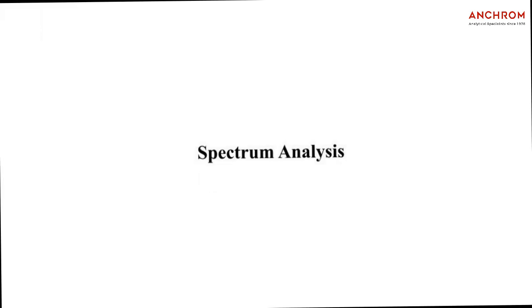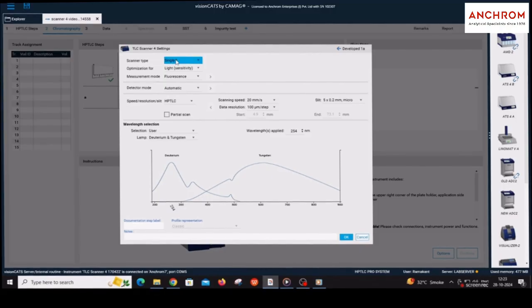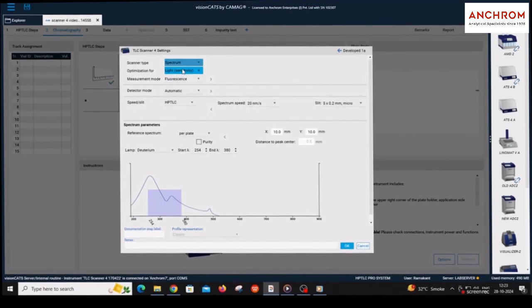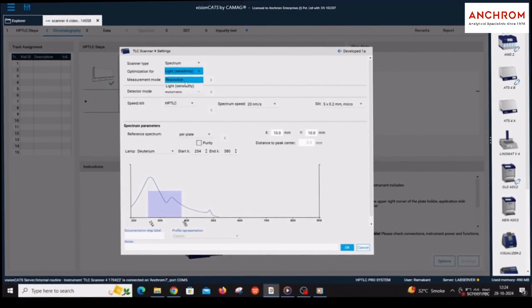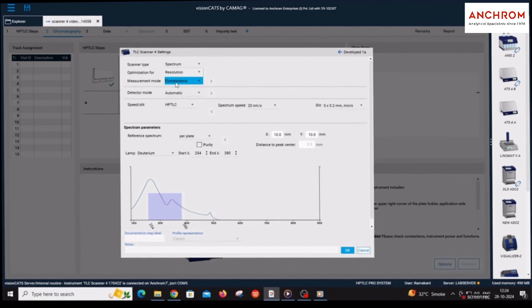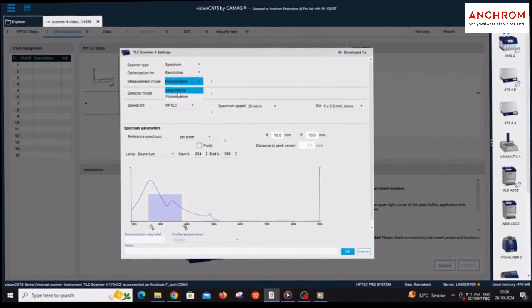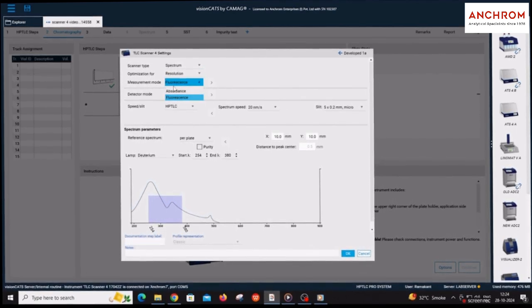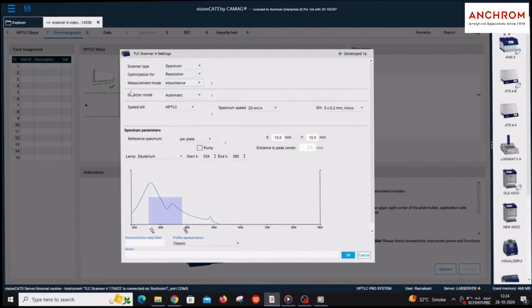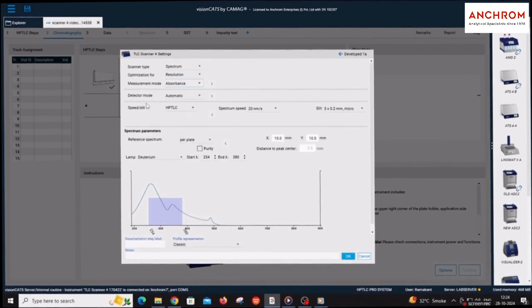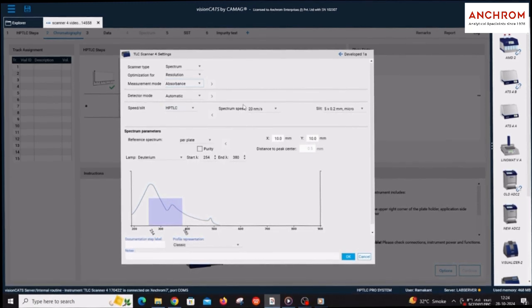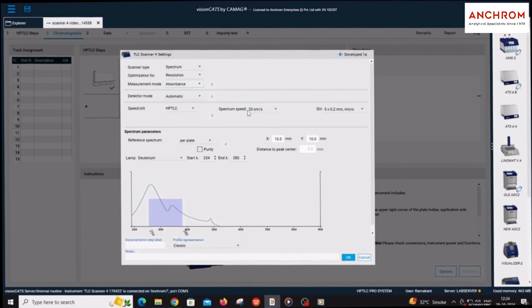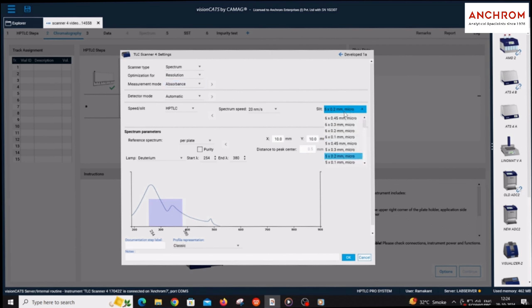For spectrum analysis, select spectrum in the scanner type. Select resolution in the optimization form. Select absorbance mode in the measurement mode. The parameters for detector mode, speed, and slit should be kept as by default. Slit is by default selected to 5 x 0.2mm micro. If application length is changed from 8mm, then select the slit as 60 to 80% of the application length.